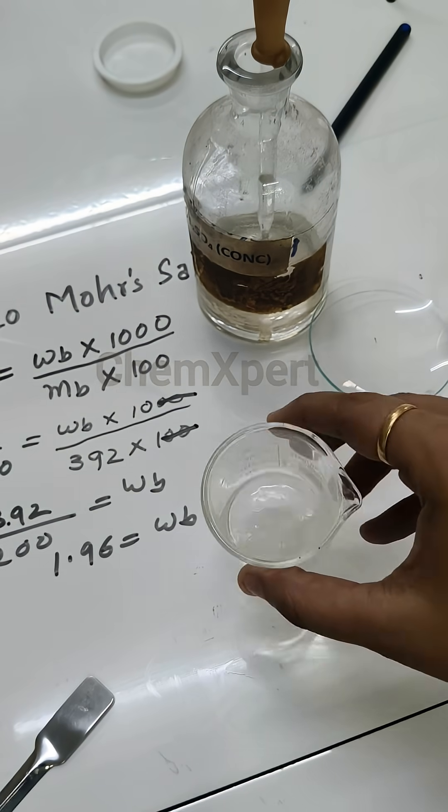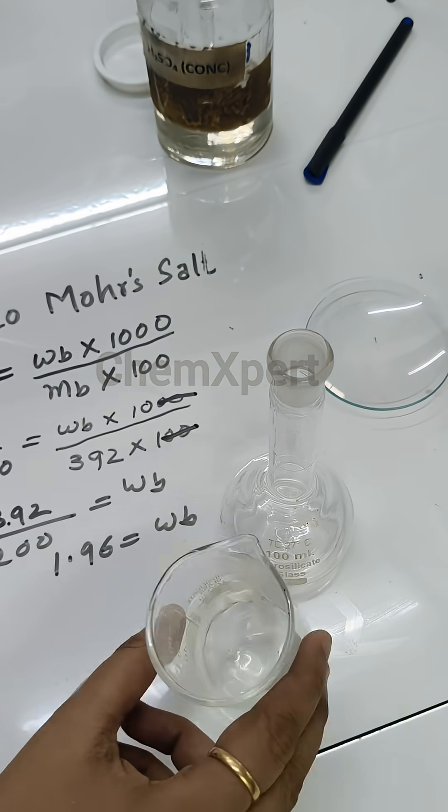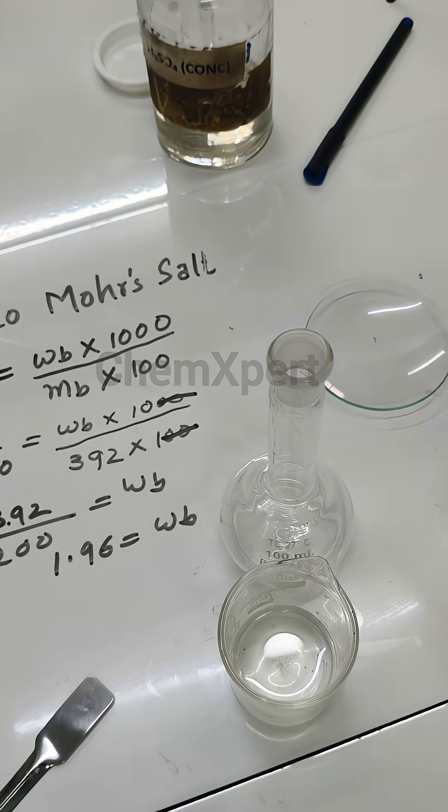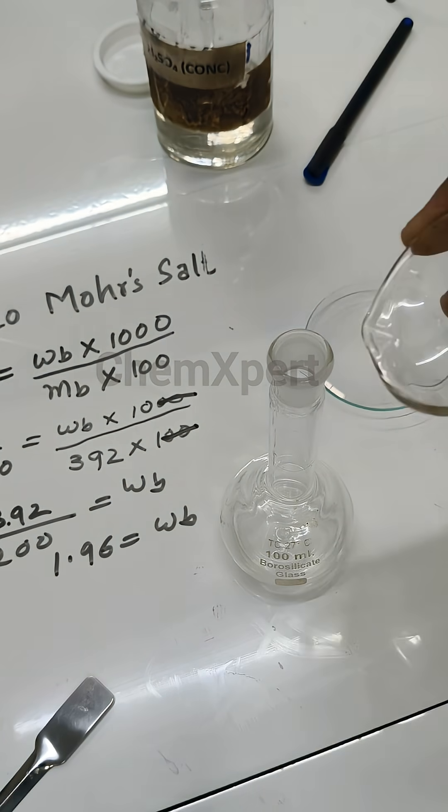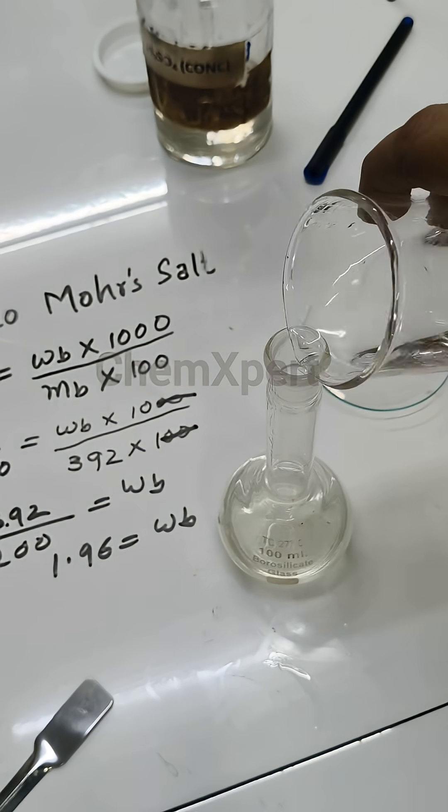Then add distilled water, dissolve in small amount of water and then pour this solution in this standard flask. Make sure you have completely dissolved the salt in a very small amount of water and then transfer it in the standard flask.